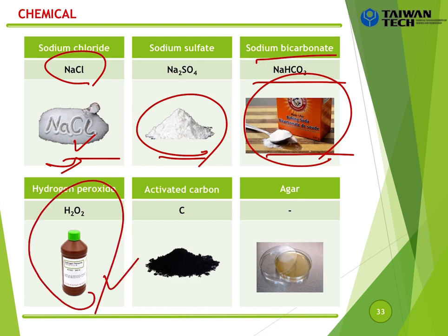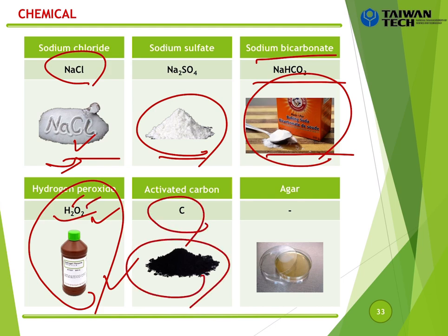H2O2, someone knows about this one, right? Okay. So you can check this one. I already talked about it in the chemistry class, right? So this one is a molecular compound. So you keep two here. We don't make it become one. Active carbon. So this one can absorb a lot of toxic material. So usually we want to absorb some toxic material. So that's the reason why when you do an experiment, we ask you to wear the active carbon mask, because it can absorb the chemical into the carbon here, can protect you, okay?